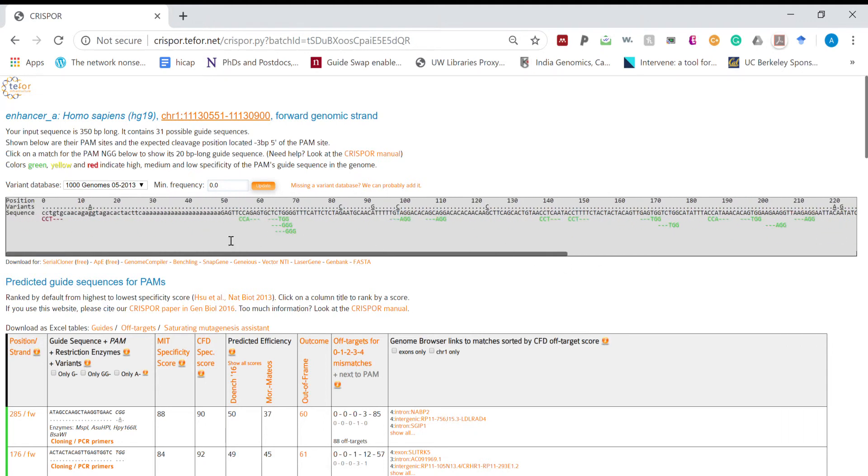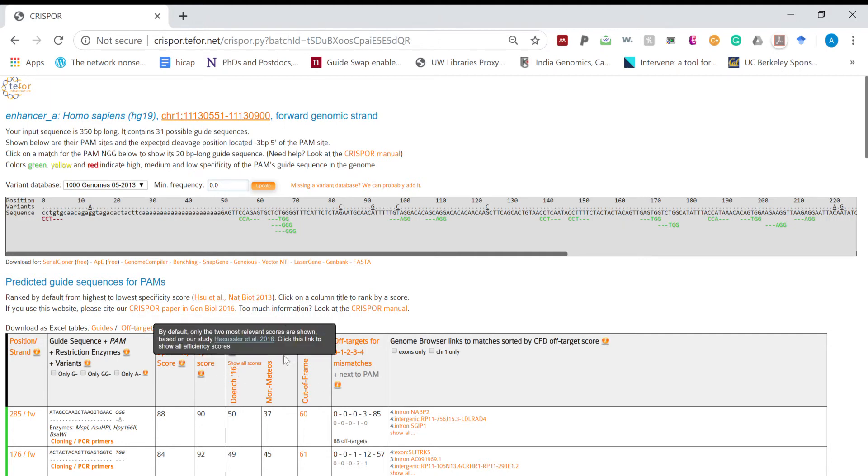In our case most of the green guides are better guides compared to red because of the different off-targeting score from different papers.